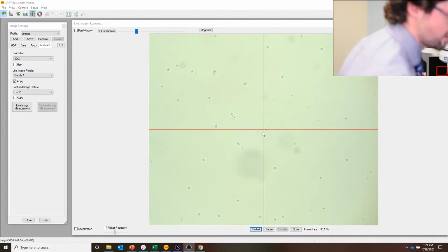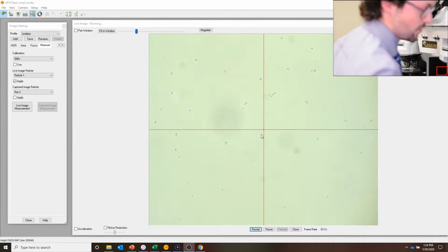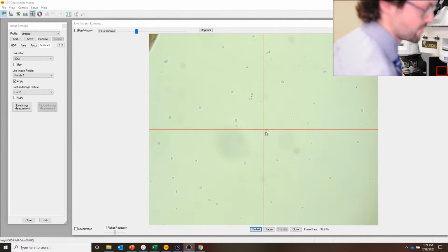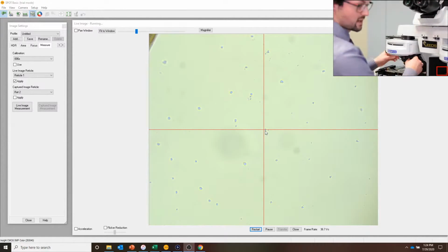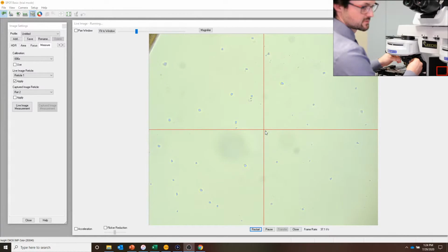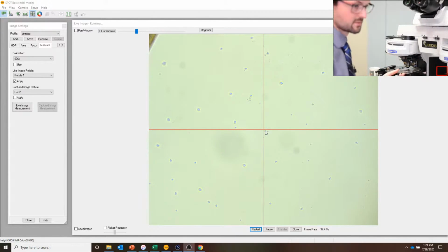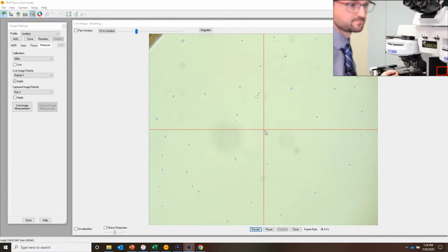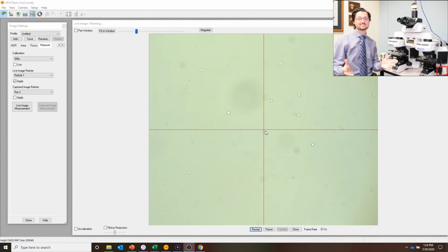And in fact, in this scenario, you actually might want to move to even a smaller dust mote, something like one of these very fine particles. And then again, we would just come back, use our centering screws, try to make some small tweaks. This is a very small one. And then just keep working like that. And that's it. You just keep redoing that. You know, watch as that circle gets made.